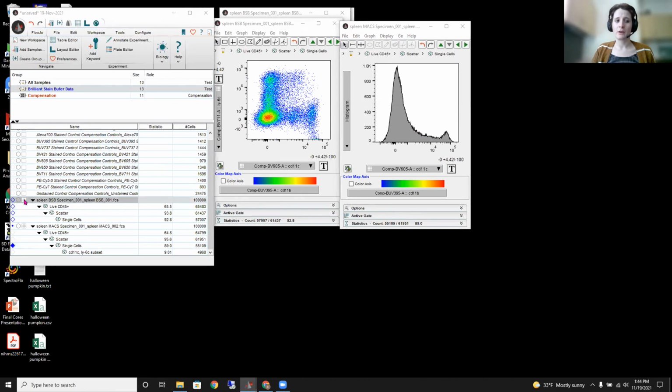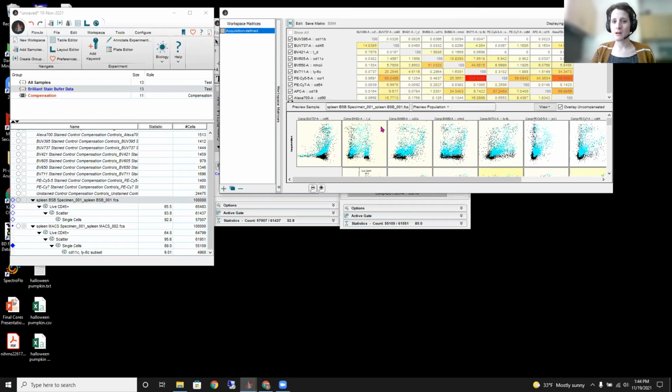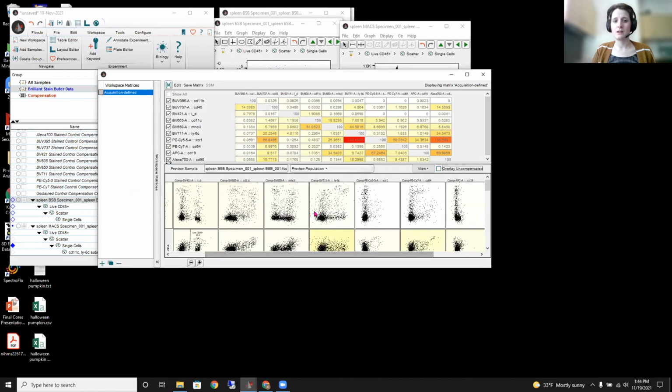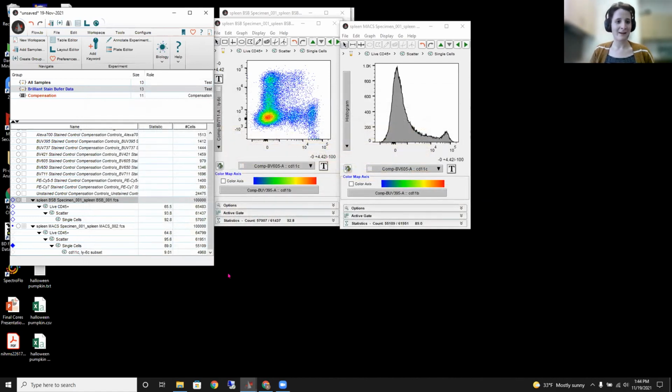And that's why you always want to go in and look at the N by N data and actually do a quality check, not just by time for fluidic stability and everything like that, but you want to check the panel as a whole to make sure that you're seeing the populations without any major indications of issues due to fluorochrome combinations that aren't working out so well, staining that hasn't been optimized, or single color controls that haven't been optimized as well. Okay. So that's my example of the Brilliant Stain Buffer. And with that, I'm going to stop my screen share and pass it along to Derek.